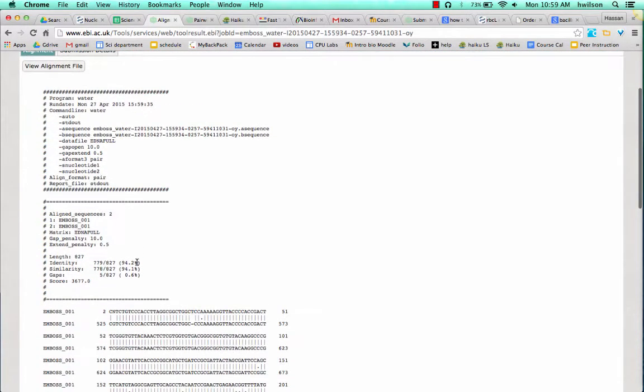Now what you see here, you see the percent identity. You'll also see percent similarity. We're going to use the identity.